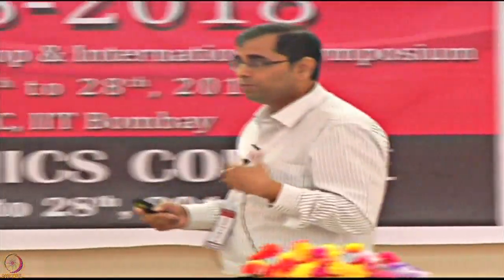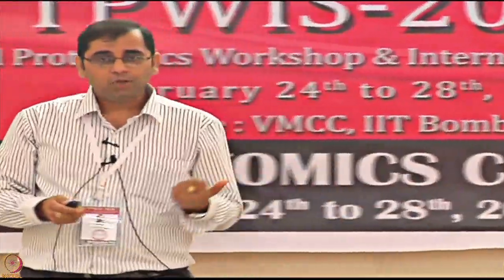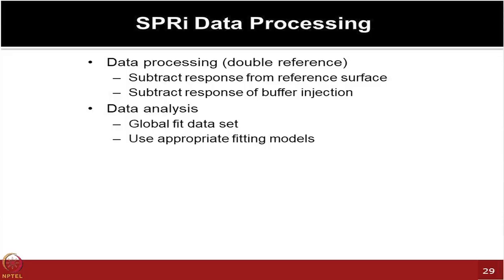Of course you need to do better fitting of these curves to find out the actual values for concentration or the KD values, but many times these experiments give you a lot of visual feel before doing that analysis. But as I said, if you want to really get the proper values, you have to do good cropping, you have to do good fitting.